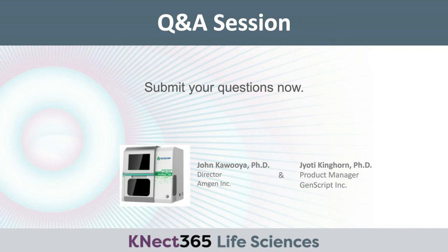Perfect. Thank you, Jyoti. Another question we have, what is the minimal affinity needed for using Mag assay systems specifically for non-FC tag protein targets? So I'm going to have to get back to you on that. We'll keep this question and we'll answer that later.